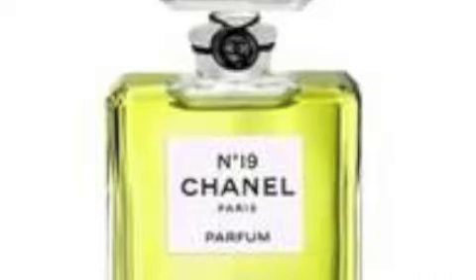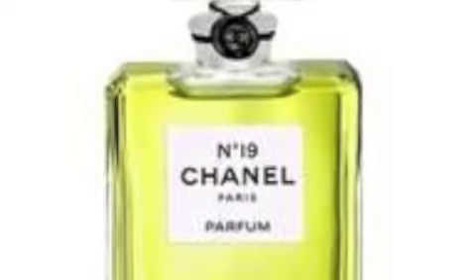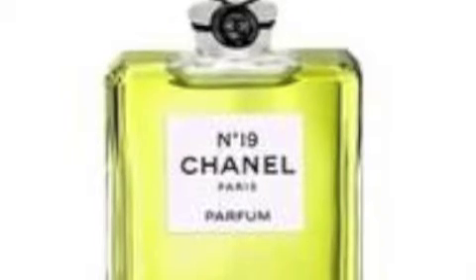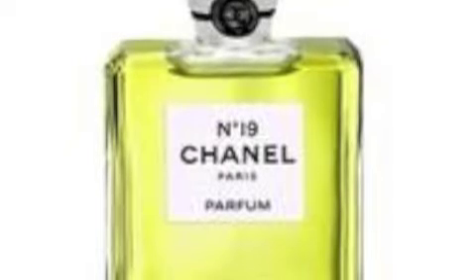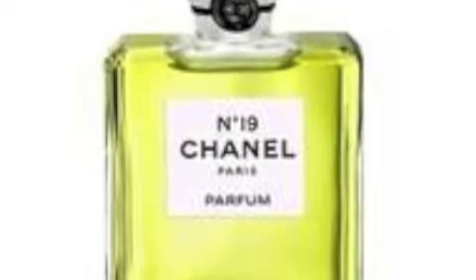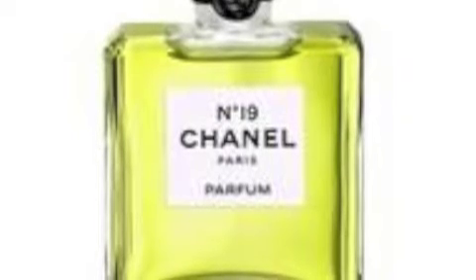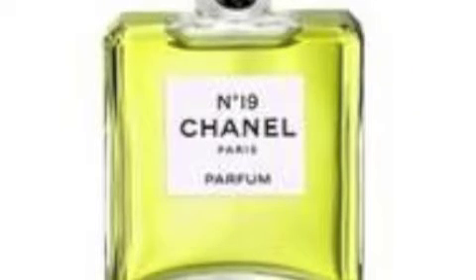While there are an infinite number of combinations of acids and alcohols, we have selected some of the most distinct fragrances. Since the reaction between a carboxylic acid and an alcohol is very slow, adding sulfuric acid as a catalyst will speed up the reaction. Esters are common in organic chemistry and biological materials, and often have a characteristic pleasant, fruity odor. This leads to their extensive use in the fragrance and flavor industry.